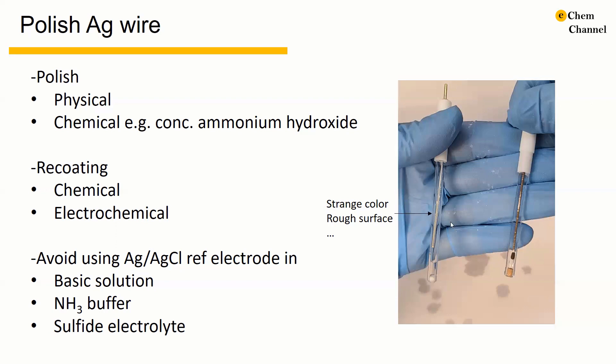For regular use of the silver silver chloride reference electrode, we should always avoid basic solutions, because silver can form silver oxide or silver hydroxide with basic solution. We should also avoid using ammonia buffer, because ammonia can dissolve the silver chloride. We should also avoid sulfide electrolyte, because silver sulfide is insoluble.